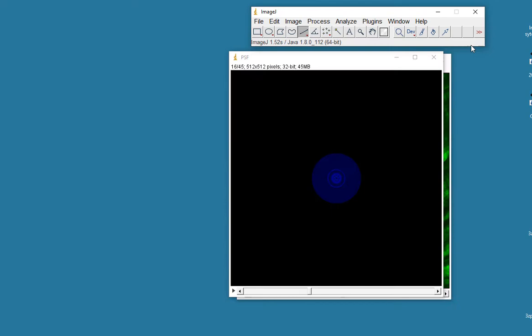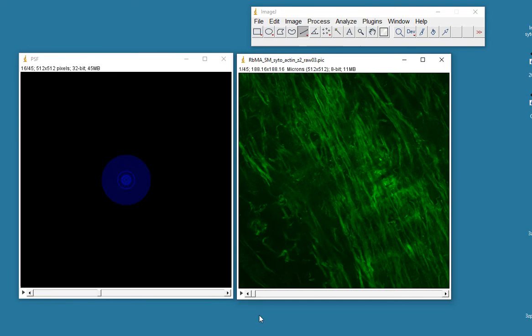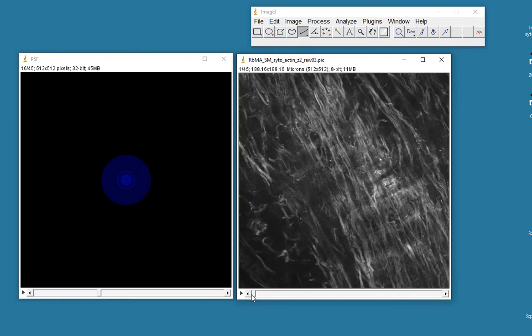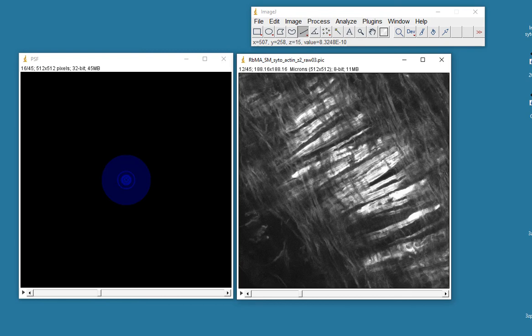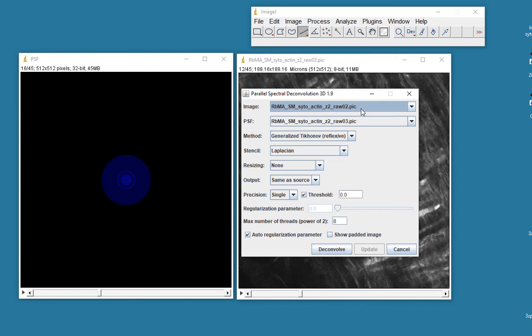I think. Okay, anyway, here we've got my point spread function. And here I've got my dataset that I want to deconvolve. I think I can make these fibers a little bit clearer. Maybe make this a little bit clearer. I think I'm going to put this into a grayscale, just to make it, yeah, looks a little bit better, I think. Okay, I want to deconvolve this dataset with this point spread function, and to do that I'm going to use my parallel spectral deconvolution. 3D spectral deconvolution.